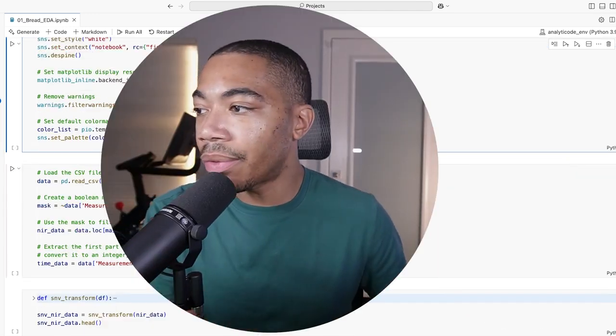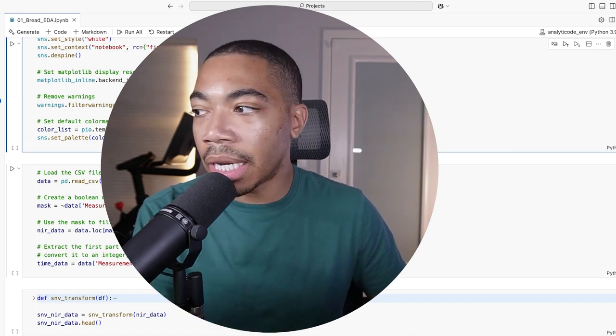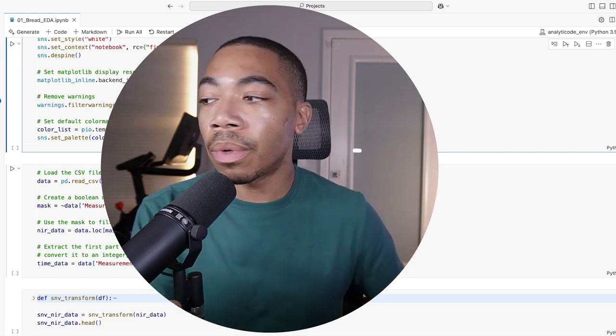I can upload this to the GitHub repository where I've stored other near-IR data if you want to perform this analysis or perhaps study some of the other changes that are known to occur within bread.